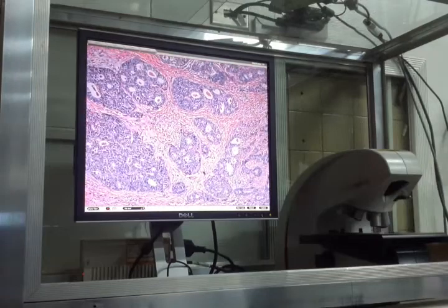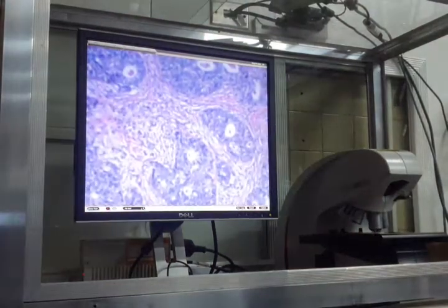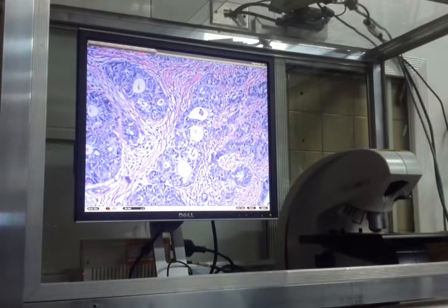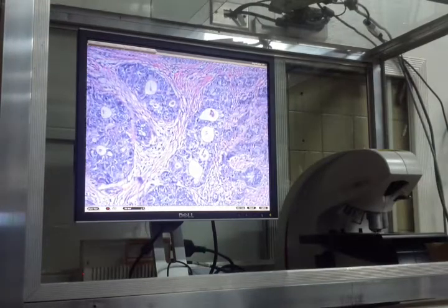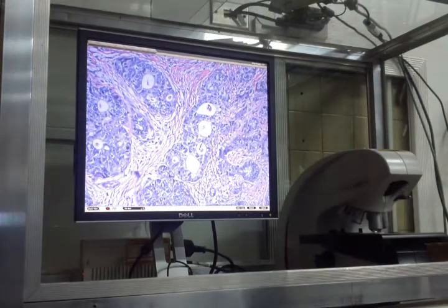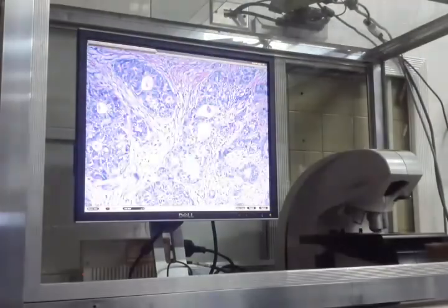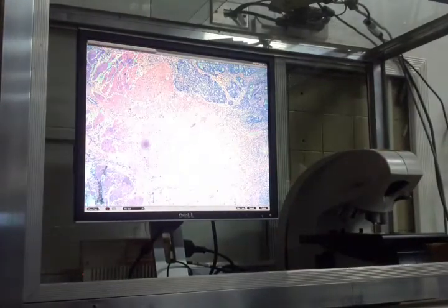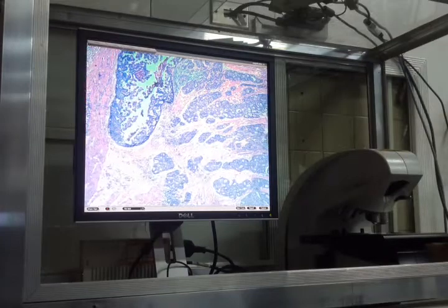Ano sa epithelial? Columnar, transitional, squamous, or glandular? Yun lang ang glandular, it forms glands, right? So epithelial forms glands. It's invading, the glands are invading the muscles. Nakakita na kayo ng normal intestinal tissue na may gland sa muscle? Wala, di ba?